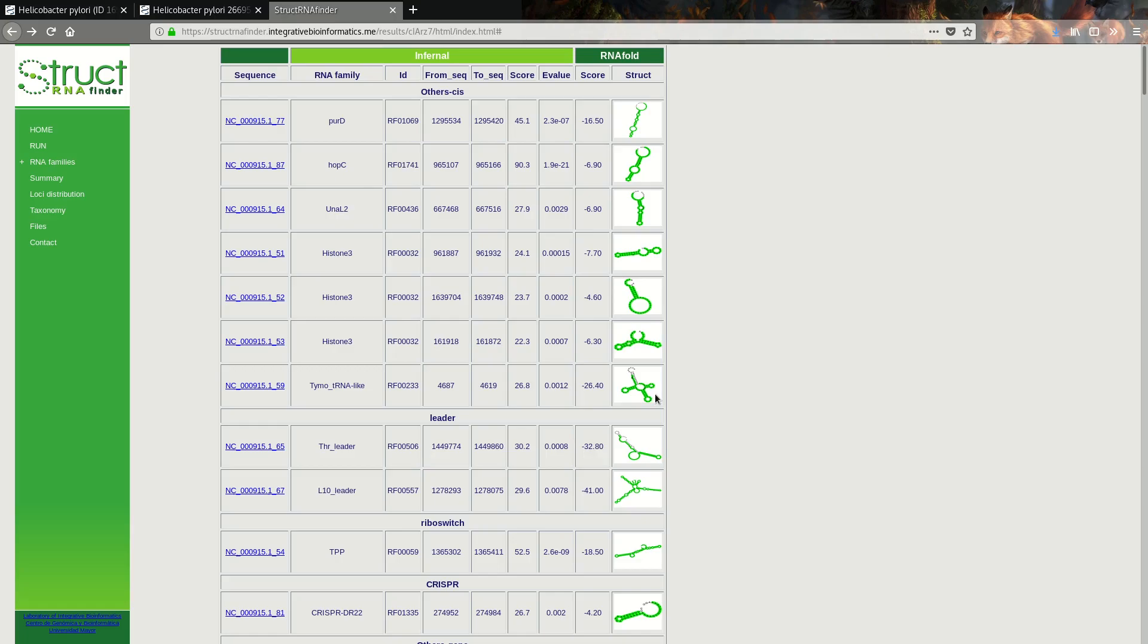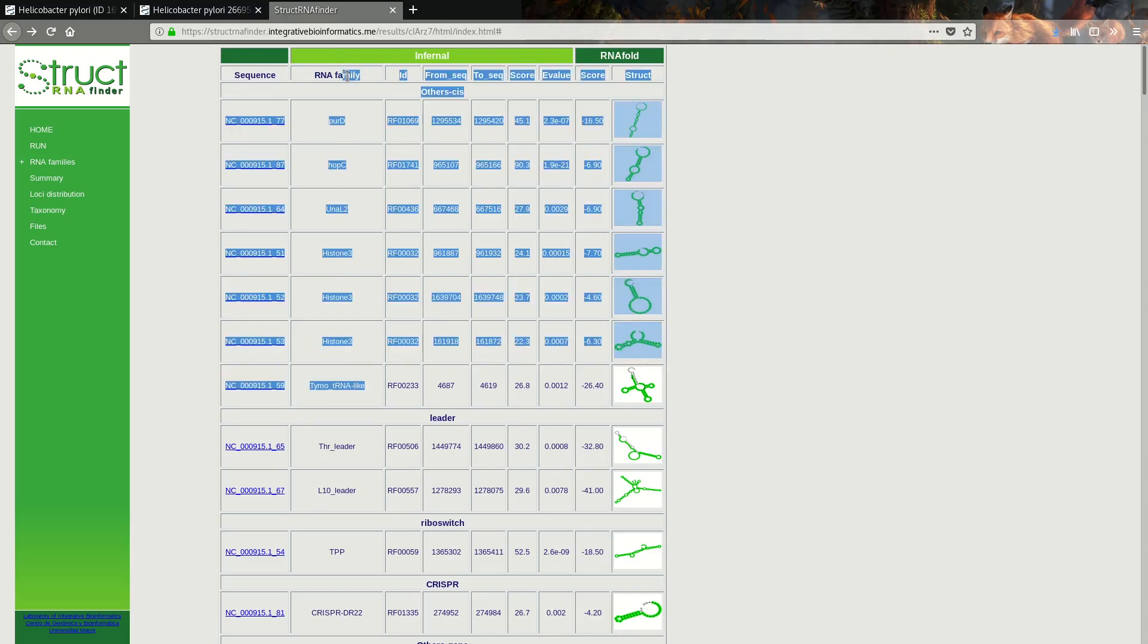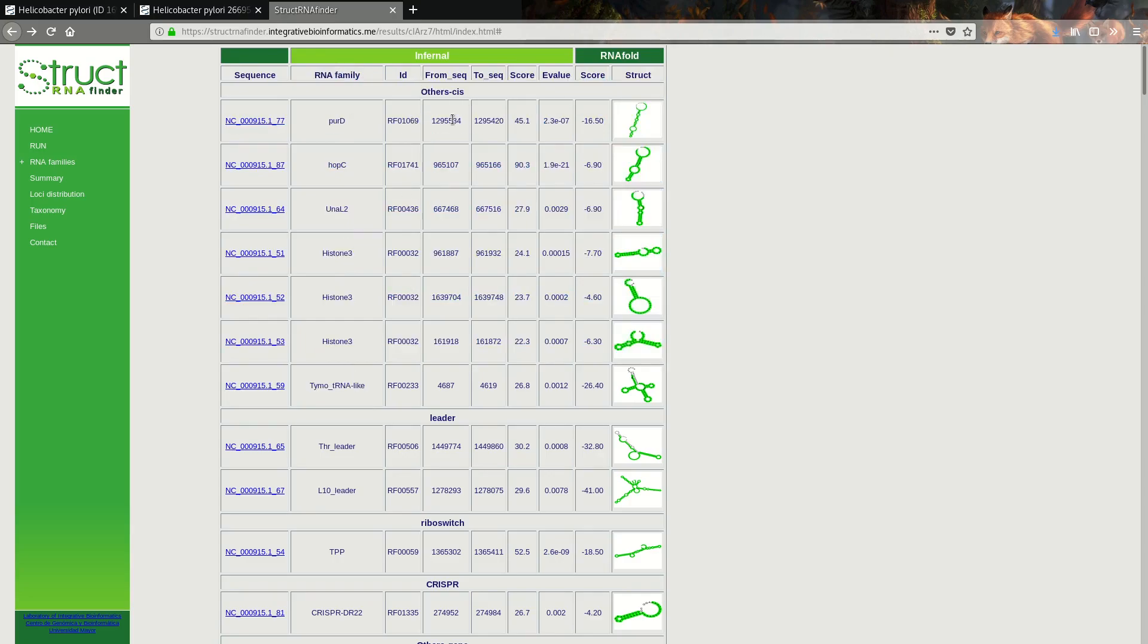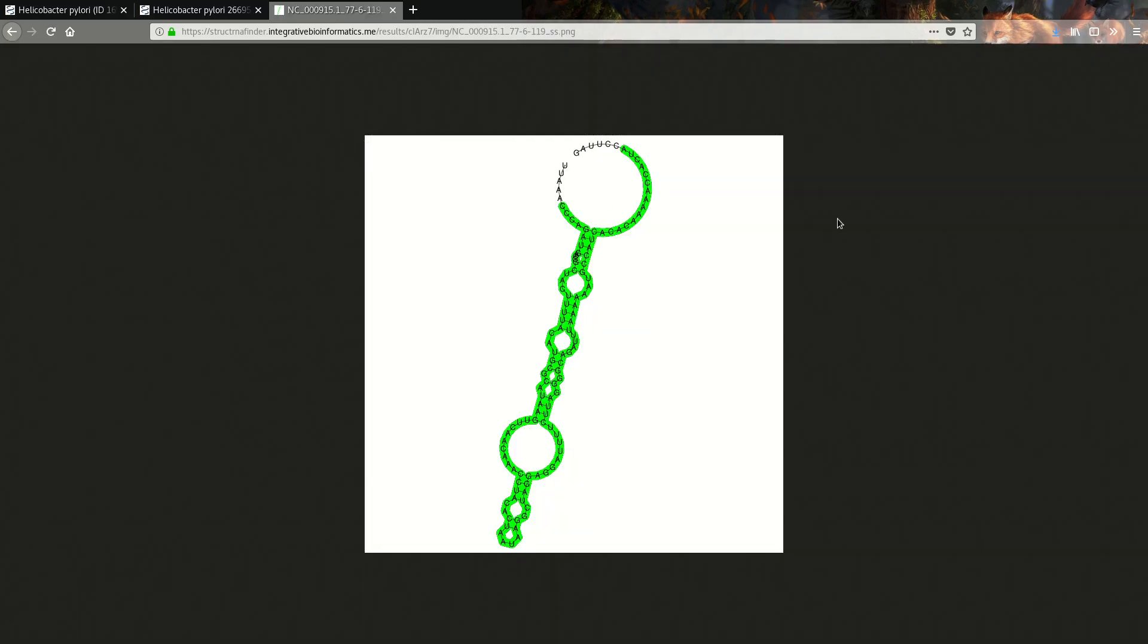After waiting for a very long time, we finally get our results. Infernal stands for the algorithm used to align sequences. We can see all sequences found in our submitted sequence, the family it belongs to, the family ID, from which sequence to what sequence the structure is found, the score, the E-value showing how likely it was random chance, and another score for the fold. We also have the RNA structure. We can click on it to see an image of how this RNA sequence would look and the alignment.